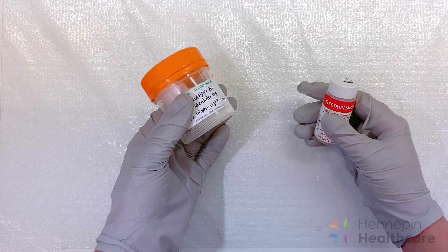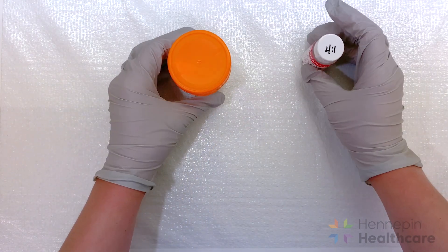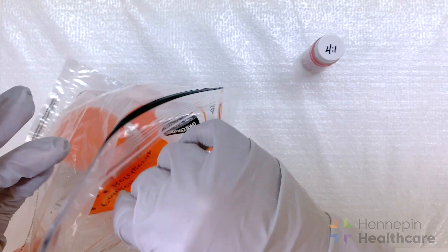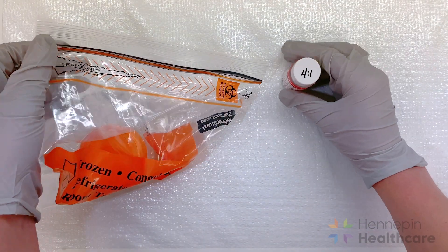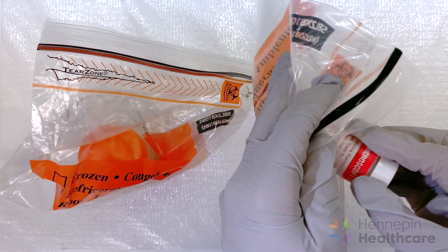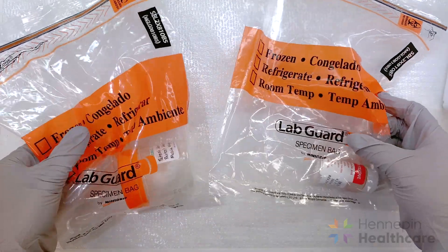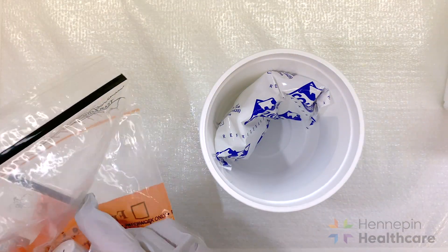Once you have both the fresh and fixed pieces in labeled containers, place each container in separate specimen bags to ensure that EM fixative does not leak into the fresh specimen container. Send the tissue over wet ice or a refrigerated ice pack.